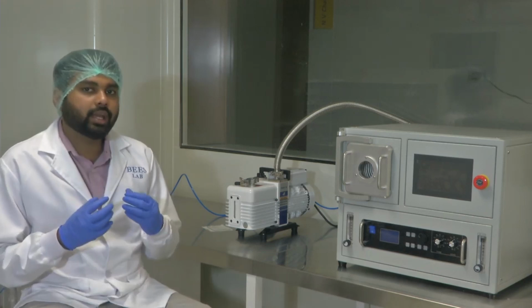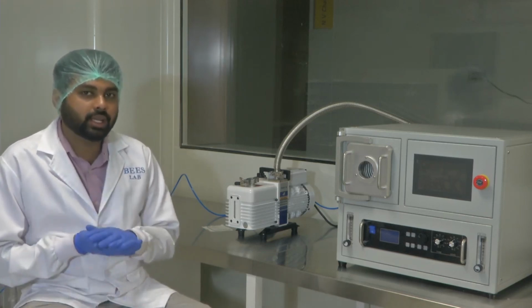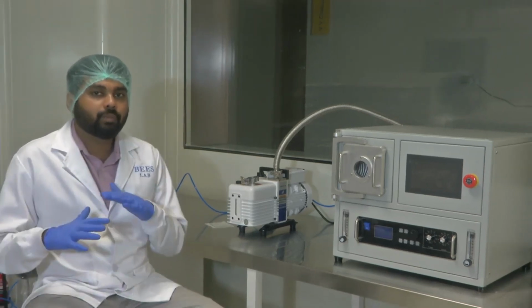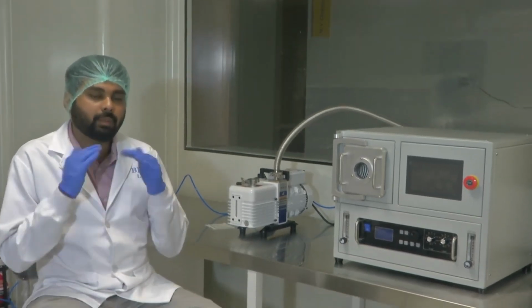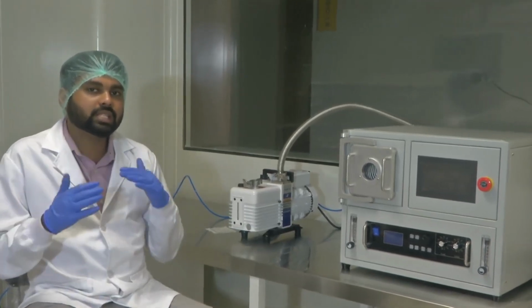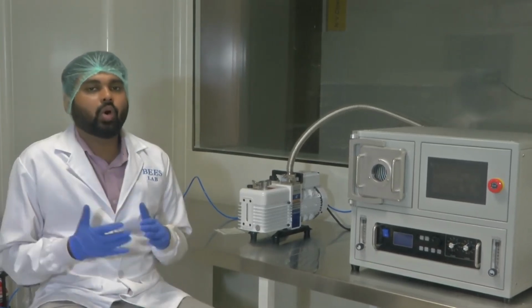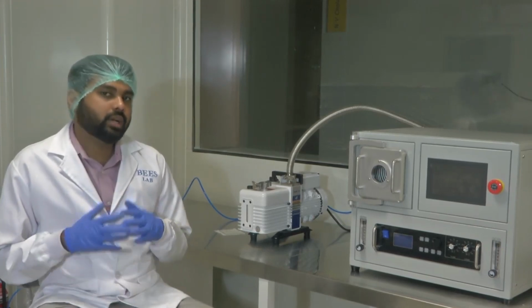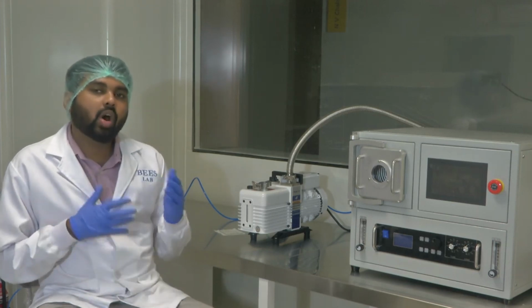So it is actually quite active. Such a plasma system is quite active, and if you place some substrate in it, these free moving electrons and atoms have the property to modify whatever substance is in the environment of the plasma. Let's say I keep a glass substrate. If there are some impurities on top of it, this plasma, because of so many things that are there in the plasma, will go onto the surface and clean the glass slide. So that is what happens. That's what a plasma system does in a very common way. So we have oxygen plasma here.